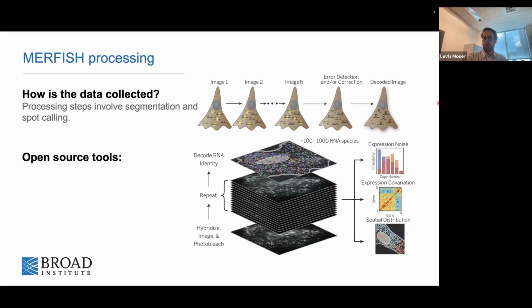And there are some open source tools, namely Merlin, which can only be used for MERFISH. Merlin was originally developed by the same lab that also developed MERFISH, but it's not maintained anymore, and it's not really functional. I mean, you can make it work if you tinker around a little bit. It's not terribly broken. There are some versioning issues with packages. And then there is Starfish, which was a bigger approach funded by CZI to build open source software that supports various different platforms.